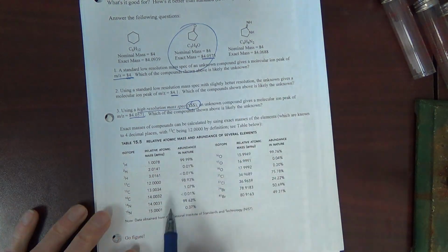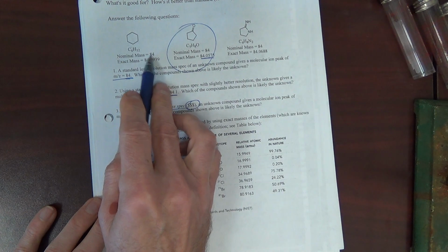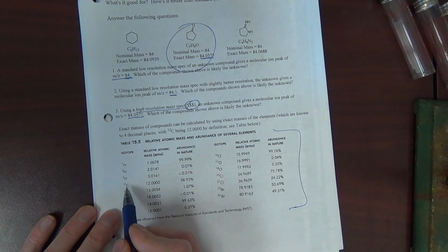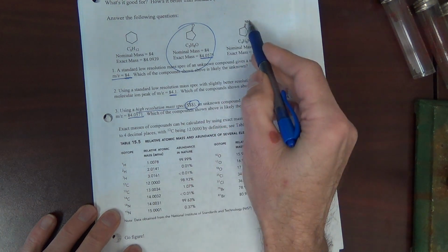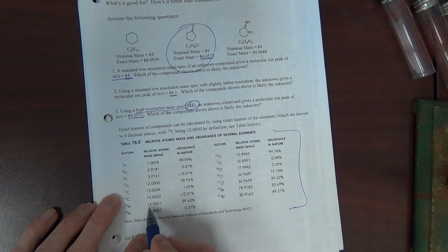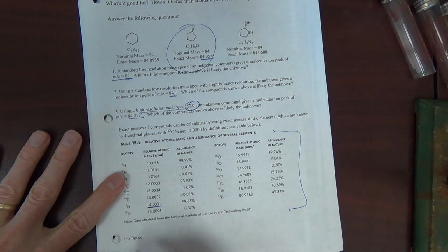Now, when you're adding these up, instead of using 12, if we used carbon 12, we could get 84. You'd have to use 4 decimal places, and you can find tables like this. And so, of course, 12 by definition is 12.0000. But, for example, nitrogen, if you stick to common isotopes, is more than 14, by 0.0031. And you would use such a number. So, go figure.